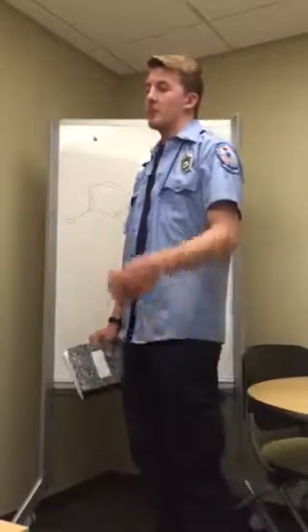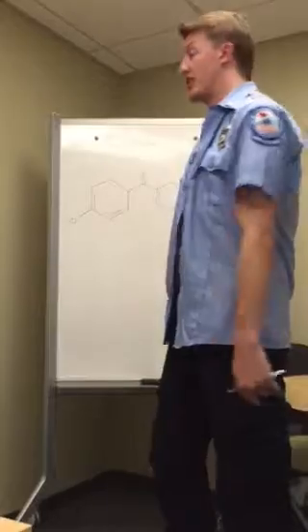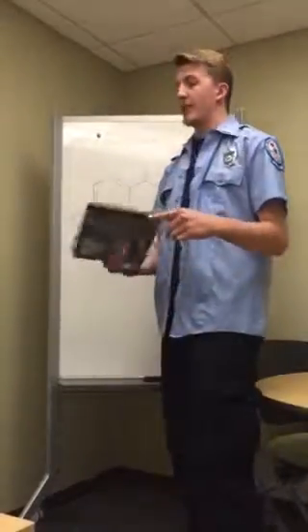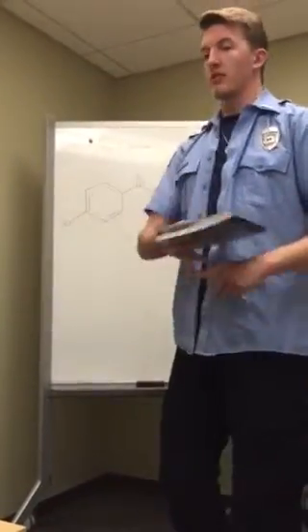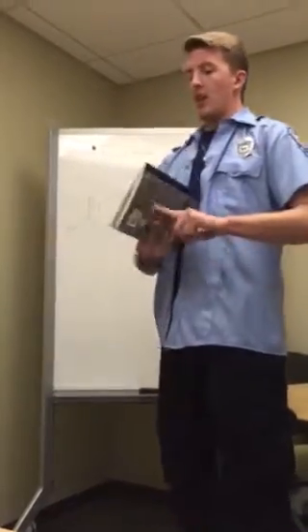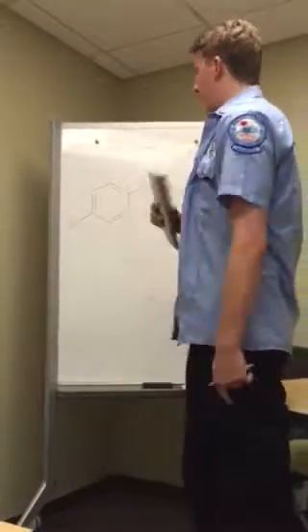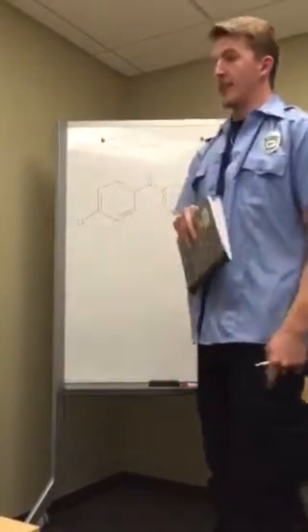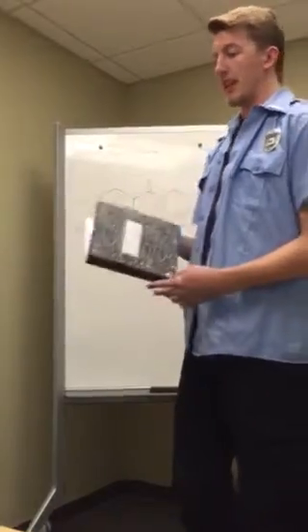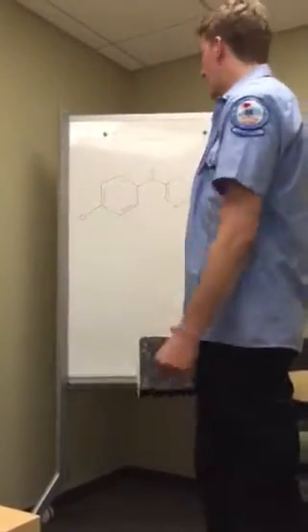This is video assignment number 2. We're talking about specific compounds that have pharmaceutical uses and things of that nature. We're talking about their structural setup, the functional groups within each compound, and the IR spectrum assignments and their frequencies. My compound was fenofibrate. It is an anti-cholesterol medication used to treat hypercholesterolemia and hypertriglyceridemia.